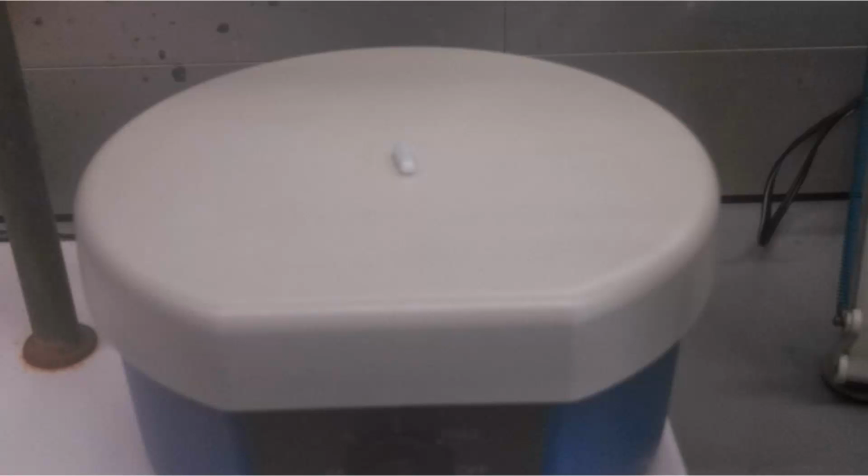So, all of the sink drains are on the right-hand side of the sink in Chem 300 lab. Pour out your beaker on the left-hand side so that if the stir bar does fall out, you have time to grab it before it goes down the drain.